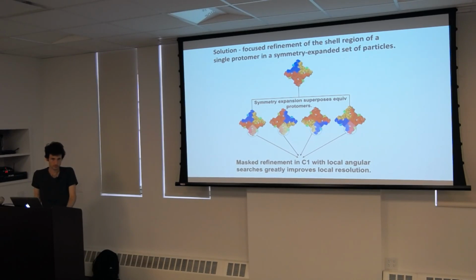So, you talked about uncertainty with your atomic models. How do you represent uncertainty in your map? Especially if you know you have good data in certain regions with a certain B factor, and the current representation is really just one B factor or one FSC mask.